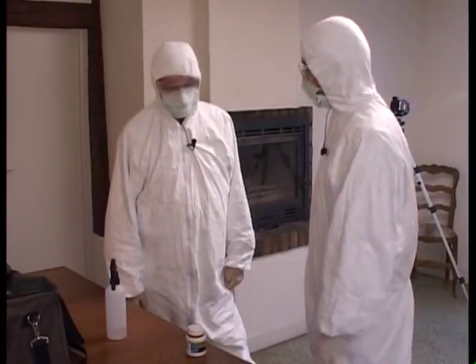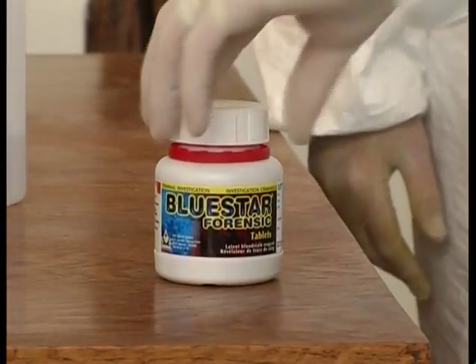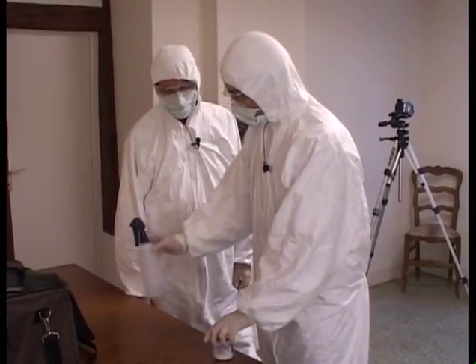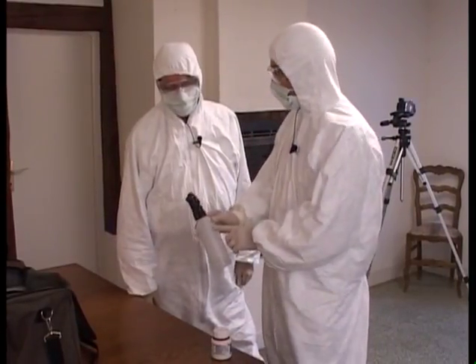I will now present a different pack: Bluestar Forensic Tablets. The product works in exactly the same way, but the preparation is slightly different.